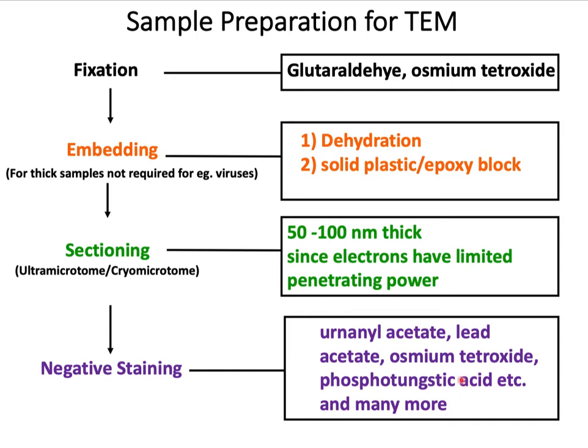The reason for using heavy metal stains is because they are electron dense, meaning the electrons will not be able to pass through them and the stains will appear dark. So the purpose of staining is that each stain has a different affinity for the subcellular structure and will bind to different structures and organelles at varying degrees. This will give the electron micrograph the black and white contrast of varying degree.